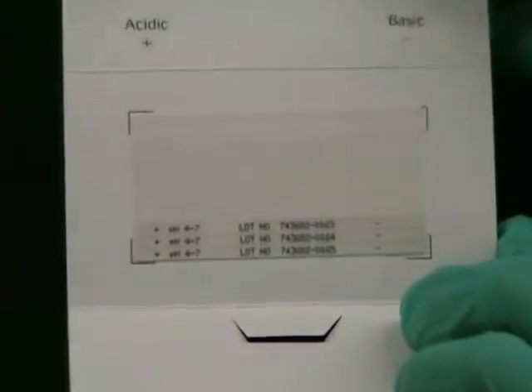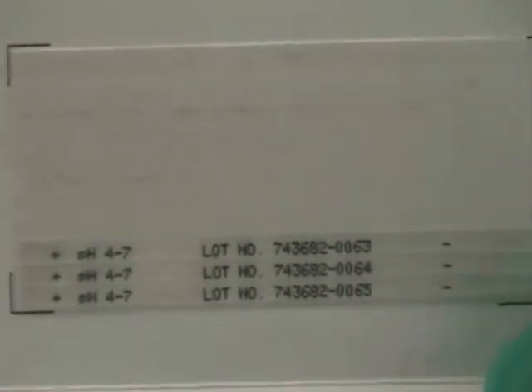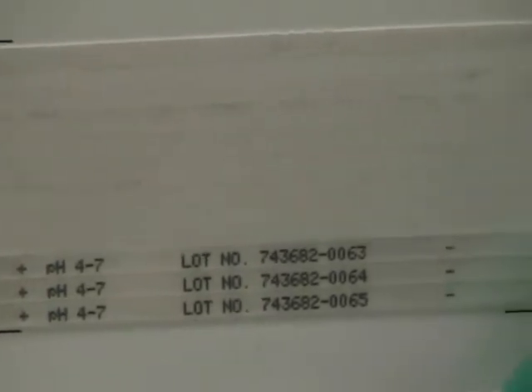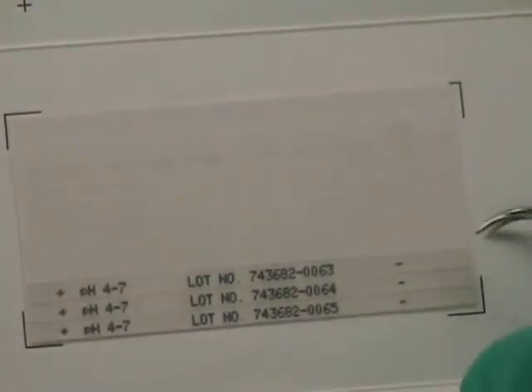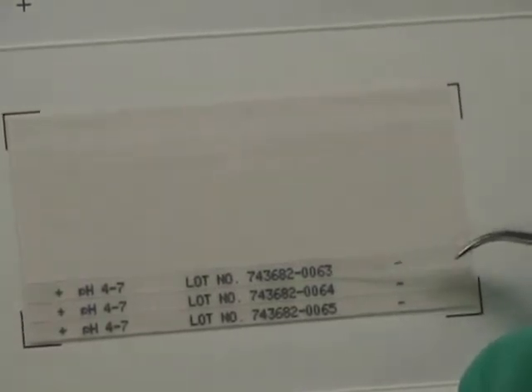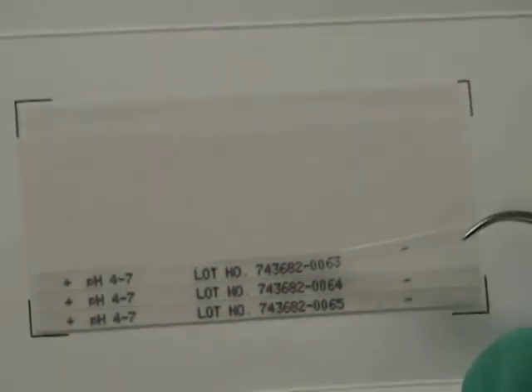The second step is to introduce the IPG strip into the cassette. The IPG strips are in this envelope, and orientation is very important when loading the strips. We have a positive end and a negative end, with the gel on the surface underneath and the plastic side with the writing on it. We will peel off the IPG strip from the negative side. Under each strip there are two little sections that do not have any gel, which enables us to hold the strip with tweezers. We pick up the strip from the negative side and peel it off carefully.